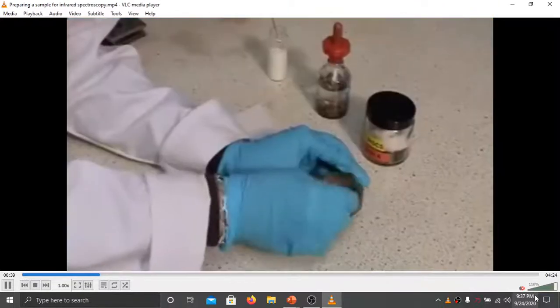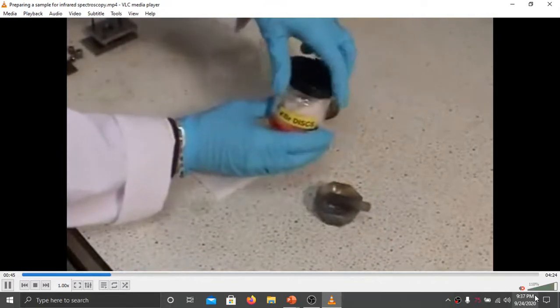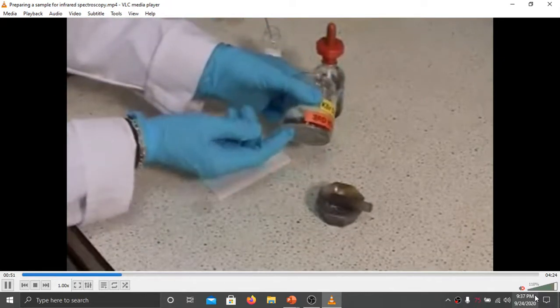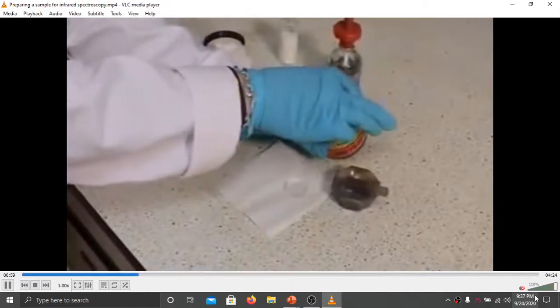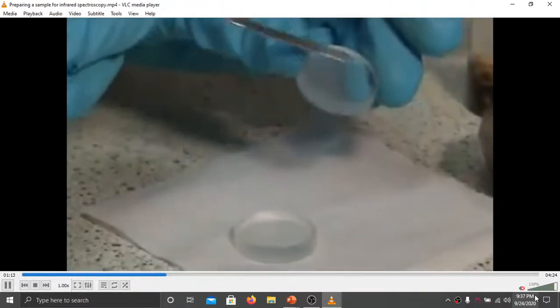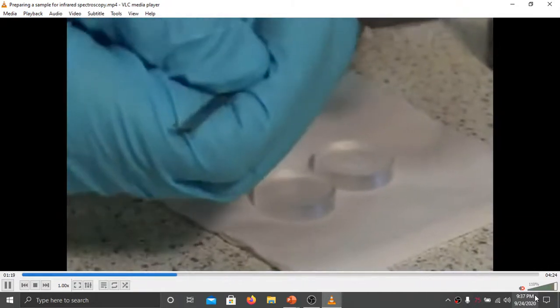We have to be very careful that we should not use an excess quantity of Nujol while forming this paste. It is to be placed between two KBr discs, which are kept in the desiccator. This is a small desiccator having desiccants at the bottom. It is kept slowly on cotton. When we are handling these plates, our hands should be dry. There should not be any moisture, and there should not be any abrasion produced on the surfaces. The material is applied with a small spatula. Care is to be taken that the spatula should not produce any scratches on the surface. Otherwise, this disc will get destroyed.